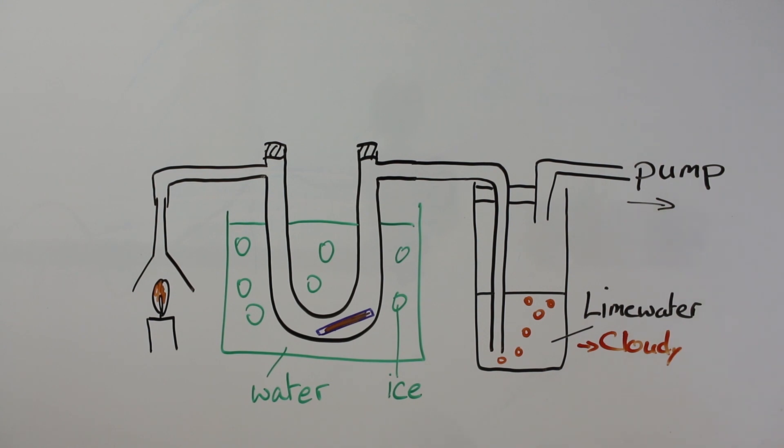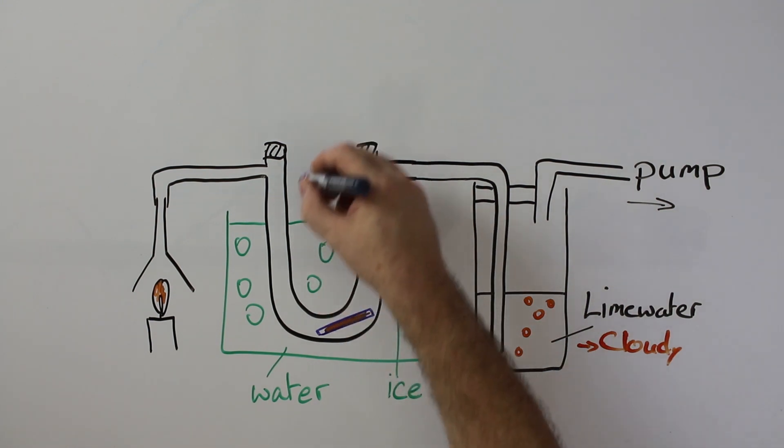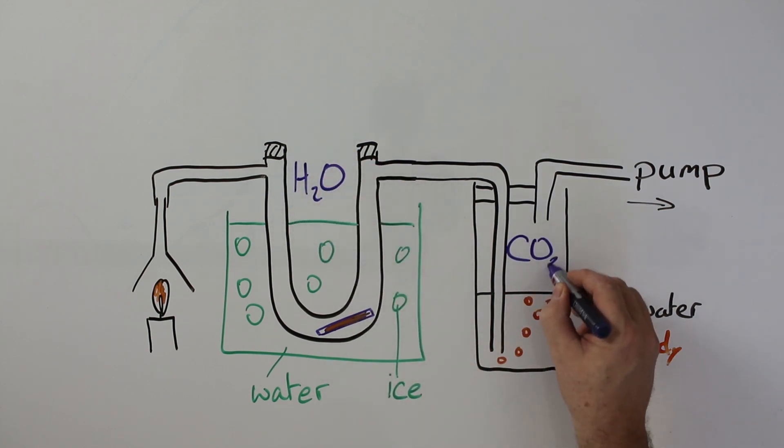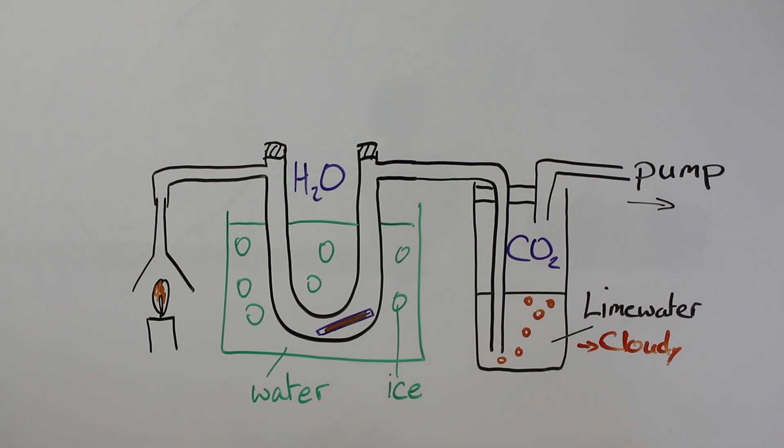So this indicates that we've got in here some water produced, and in here we've got a test for carbon dioxide. So carbon dioxide is produced.